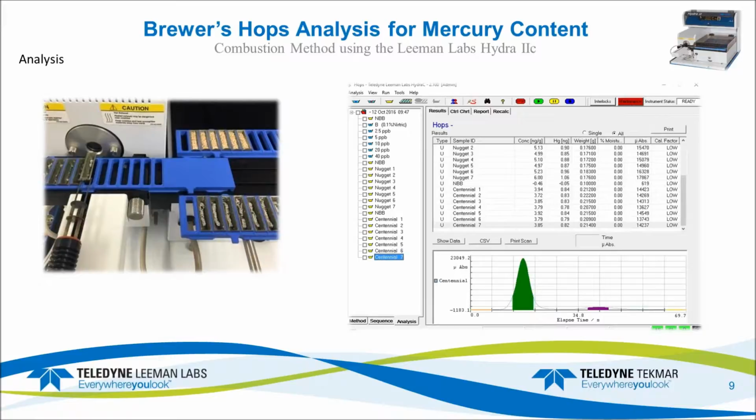And then on the right side, when we're getting into higher levels, is where we have a smaller peak. It's a very short cell. It's a 1-inch cell as opposed to the 10-inch cell to give us a greater dynamic range.